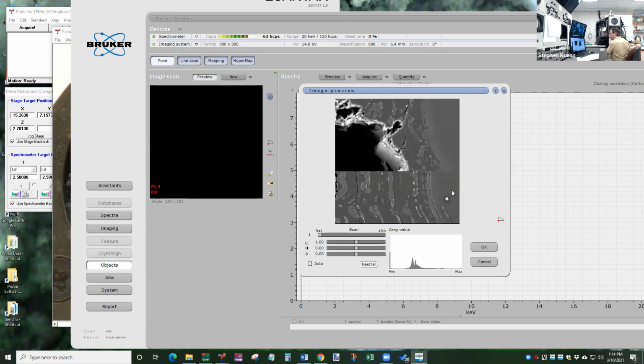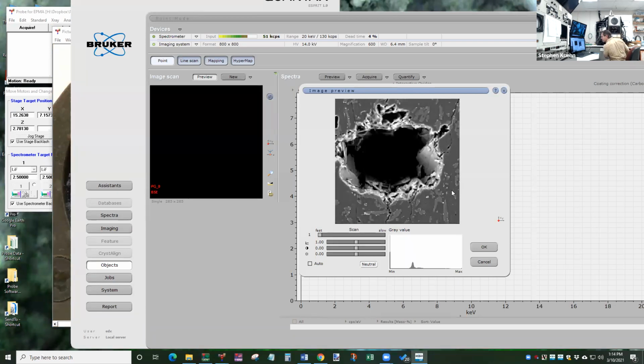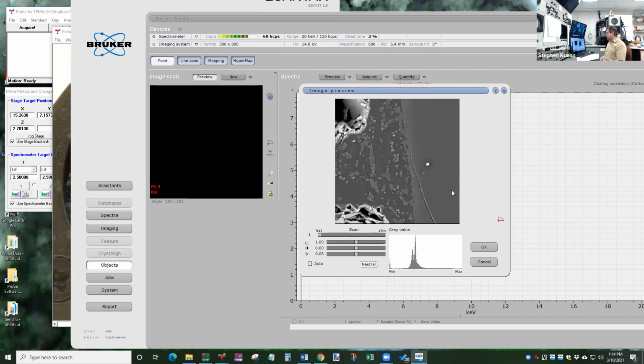So there's another one of those little holes here. Looks like a crater. I think actually I see crystals down inside of that too, little ones. All right, so there's part of our big crystal. And by the scale of what the microscope can see, it's enormous. But right next to it, you can see this area with lots of little crystals in it. They're sort of bright, long things. So those are microscopic crystals. If you were looking at the rock with just your eyeball, you wouldn't even be able to see those.